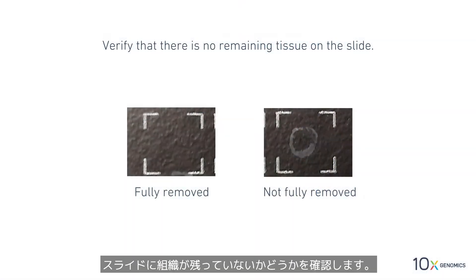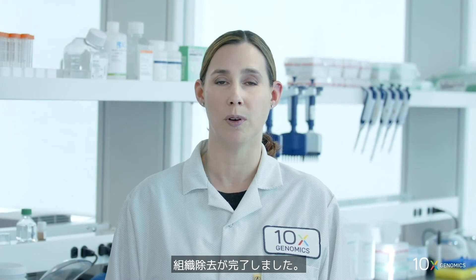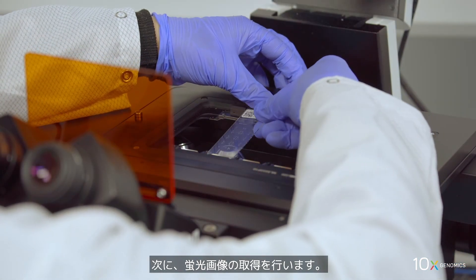Verify that there is no remaining tissue on the slide. We have completed tissue removal. Next, we will image the slide with fluorescent settings.